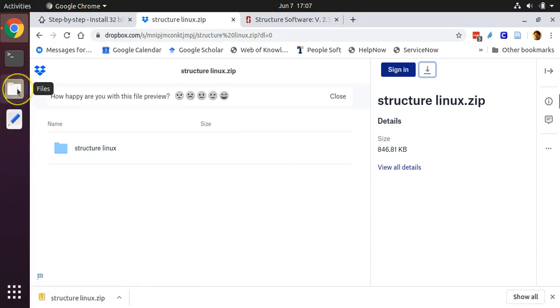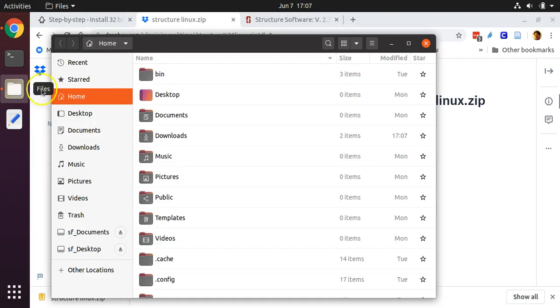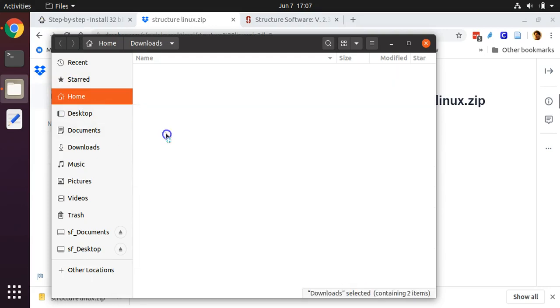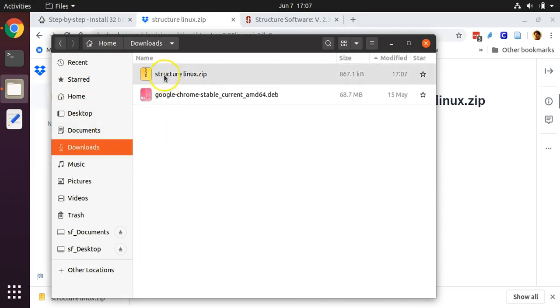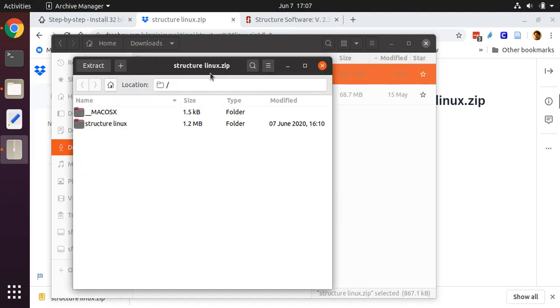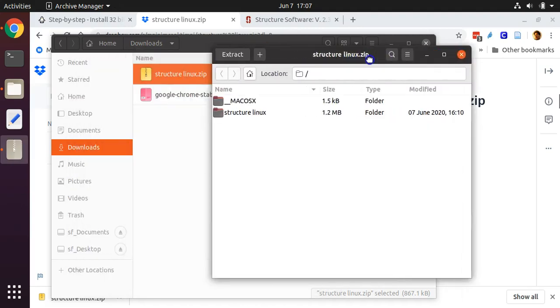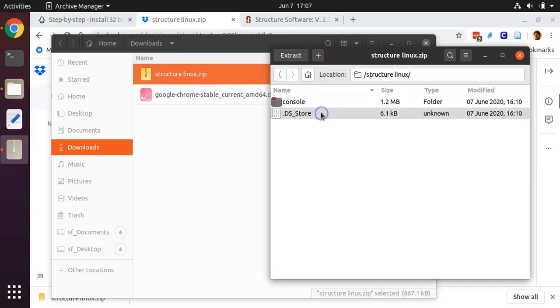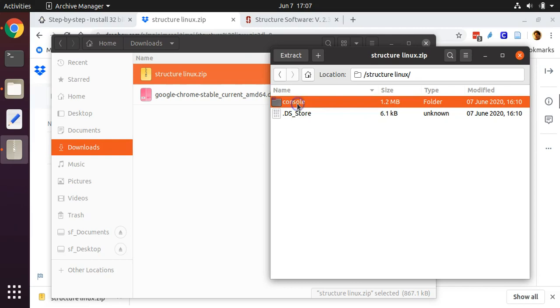Next, we're going to open up a finder window and navigate to the downloads folder. Once we're in there, we're going to double click on structurelinux.zip. This will bring up an archive manager program that lets us look inside of this zipped file. Double click on structurelinux. This folder called console contains the software and the sample data.